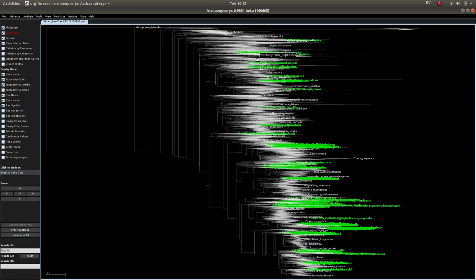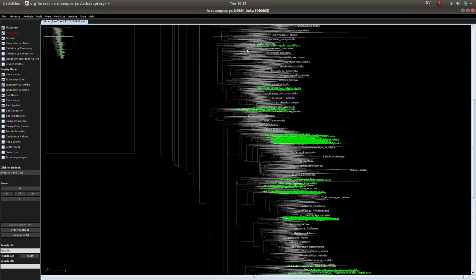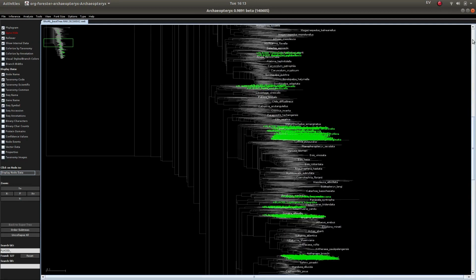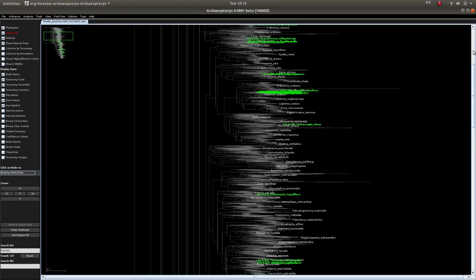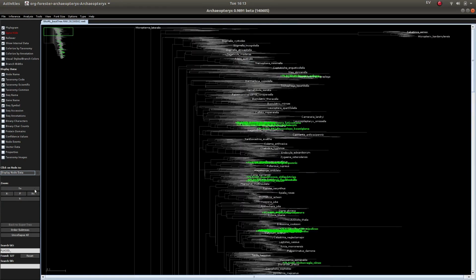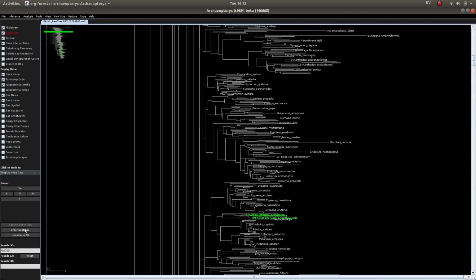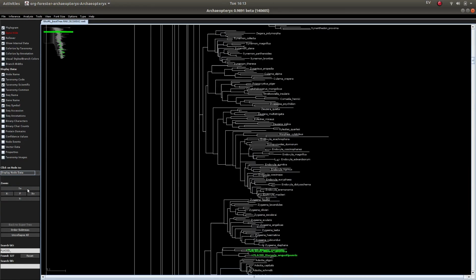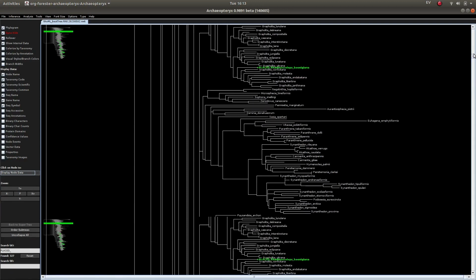So again, these are the non-highlighted ones. These are the original reference tree, and now we've applied the new step. The original was all fixed constraints, and this additional step is for soft constraints, and these soft constraints are a lot less reliable to place, which is why I want to inspect them, which we can do now. Just have a look and see if these look reasonable.